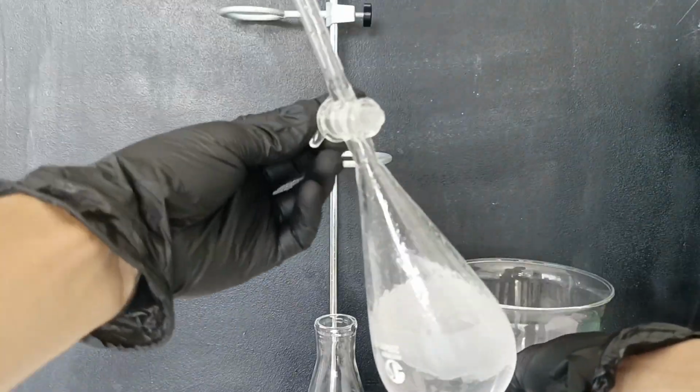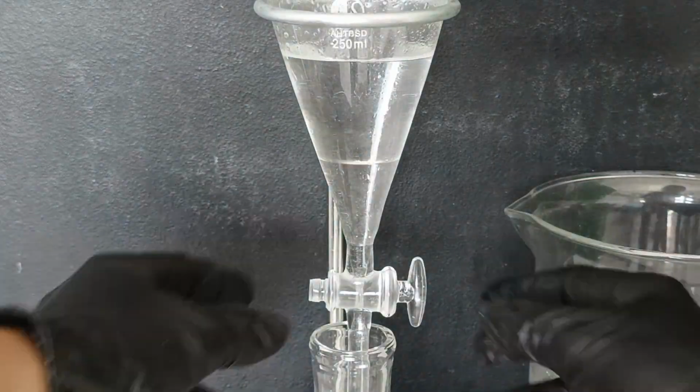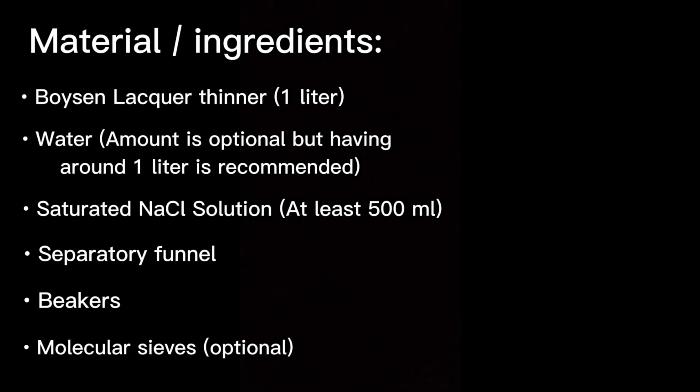Toluene is a pretty commonly used organic solvent, and today I'm going to be extracting it from lacquer thinner. Here are the ingredients I used.